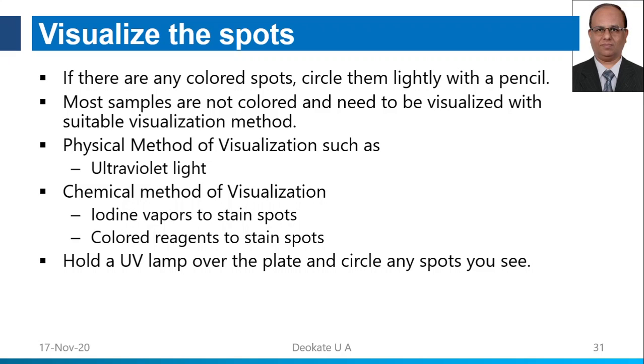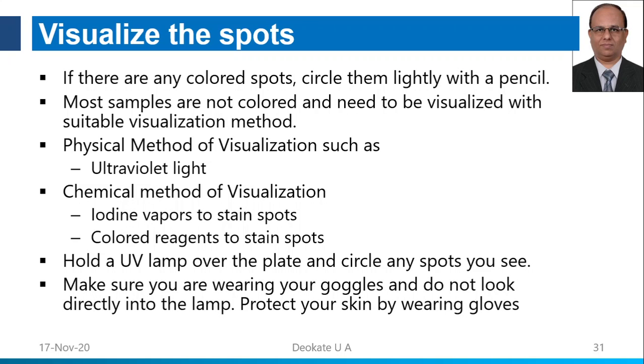While you are using the physical method, that is using the UV lamp, circle the spots while the plate is under the lamp. Make sure you are wearing goggles and do not look directly into the lamp.